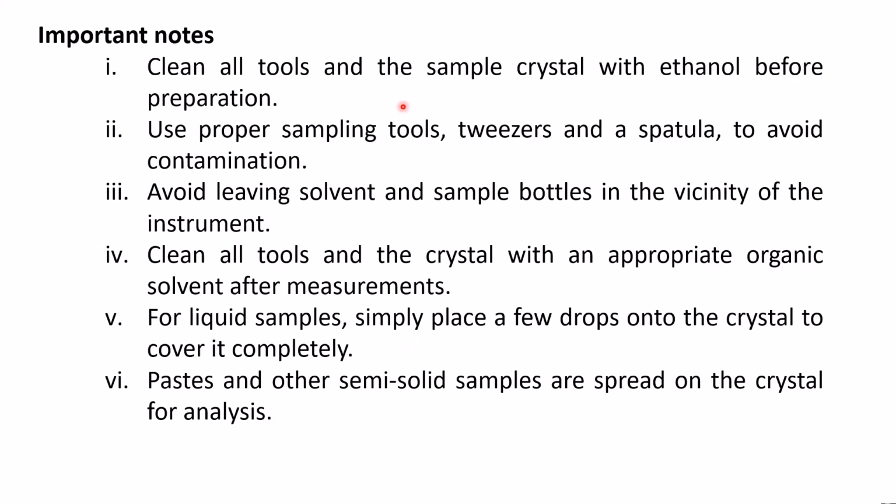So these are some important notes. You have to make sure that you clean all the tools and the sample crystal with ethanol before sample preparation. Then you have to use proper sampling tools, tweezers, and a spatula to avoid any contamination. There are quite a number of things you have to make sure you do before and after running your sample.